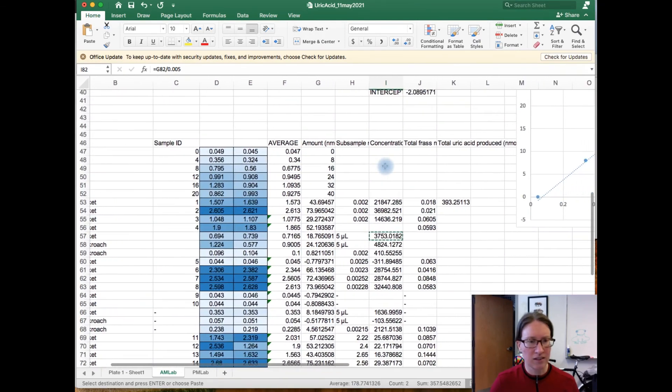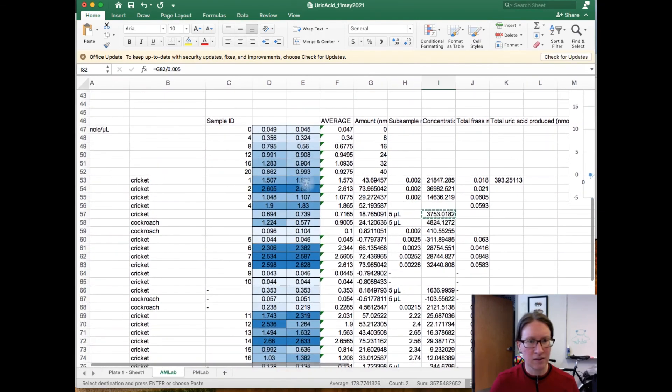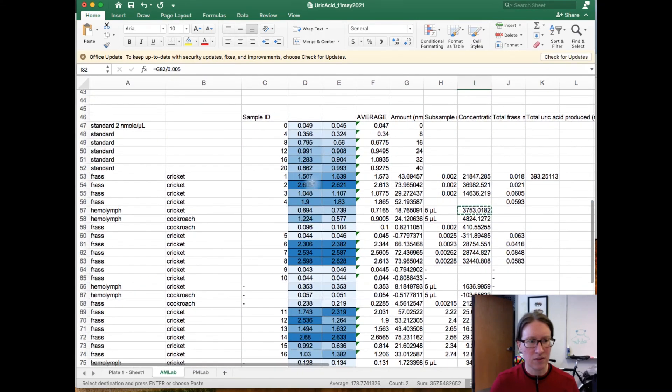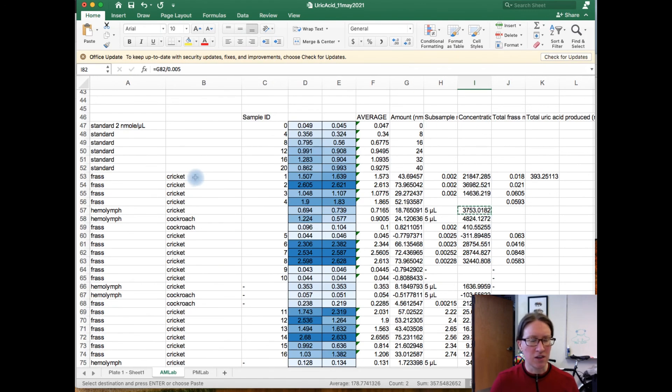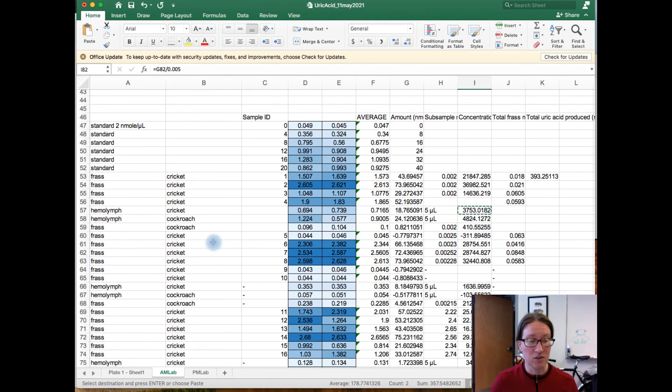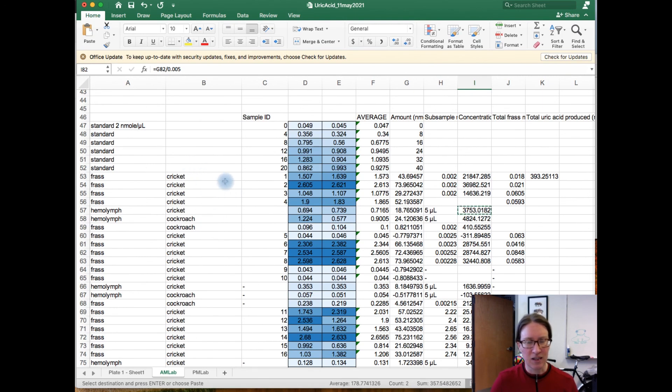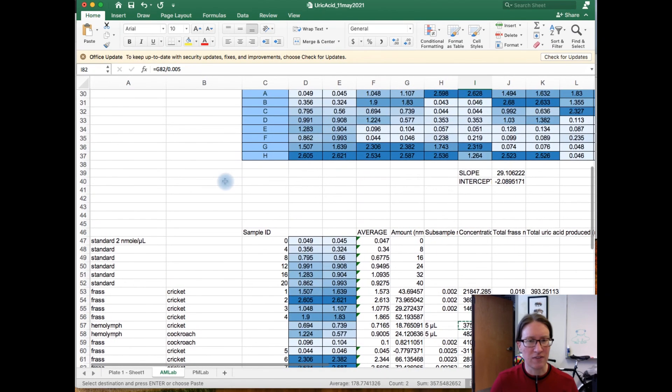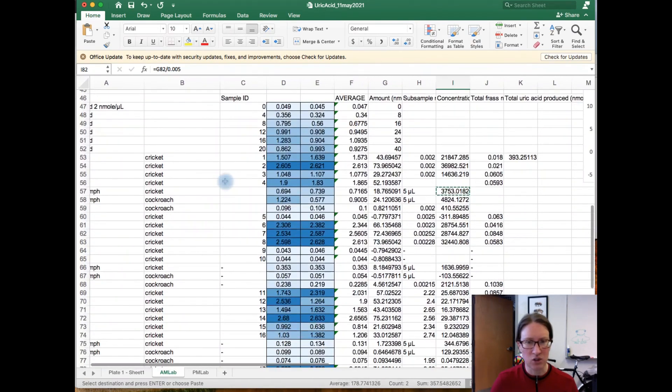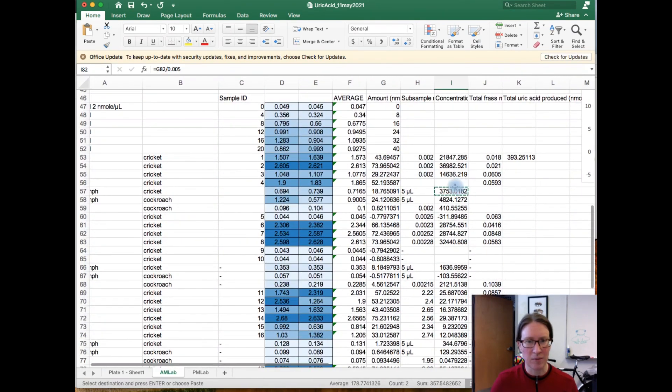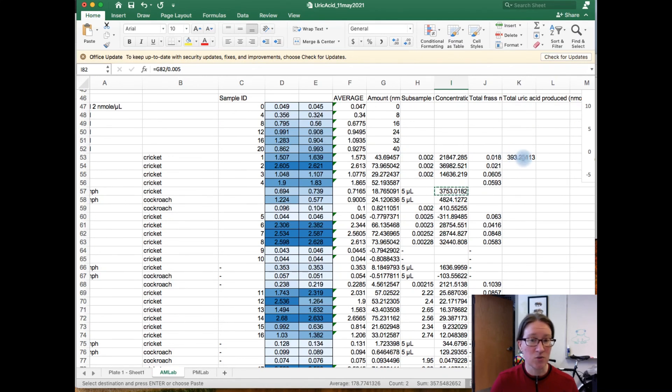And collectively then, that gets everything into units where if you are preparing a data summary for this lab, you should now be able to compare the concentration of uric acid in the frass relative to the concentration of uric acid in the hemolymph for both cockroaches and crickets. And if you are in charge of a figure for the poster, I should also now be able to figure out the amount of uric acid excreted per day by these crickets.